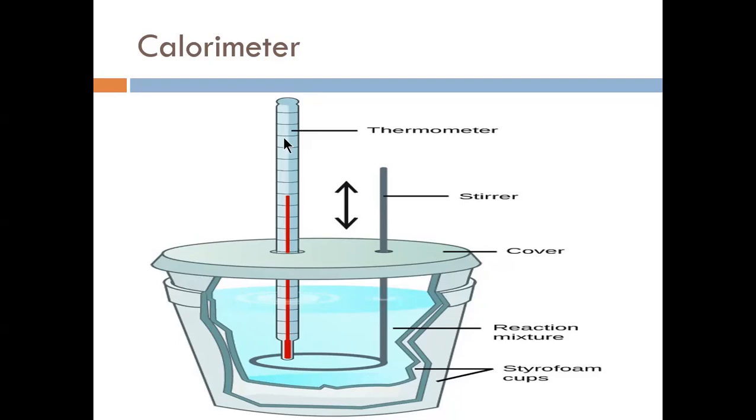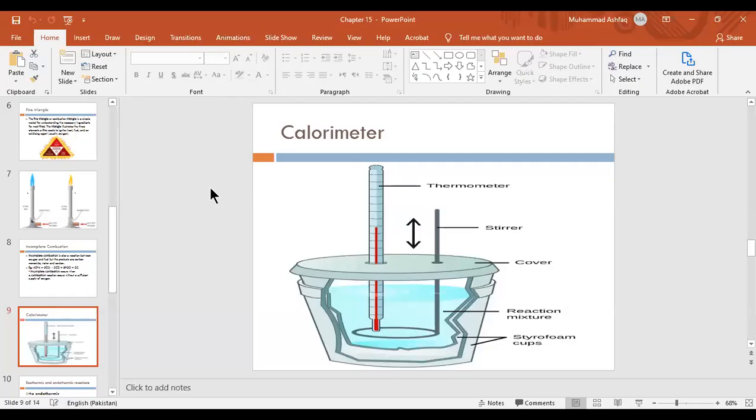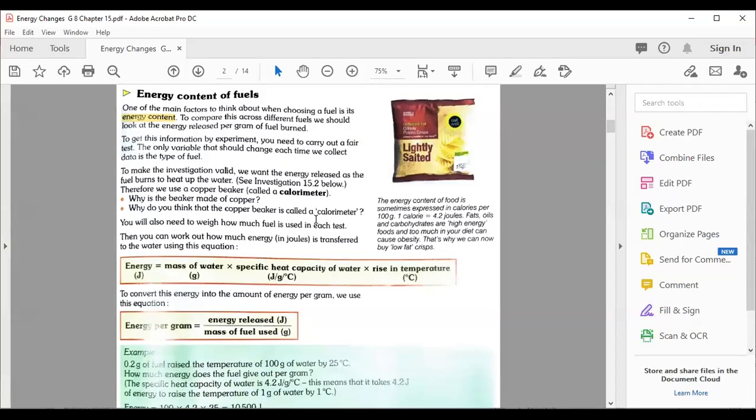Till here, my dear students, if you have any question, please raise your hand, otherwise type no. Yes, Ahmad Musab. Sir, we will put the burning fuel in the styrofoam cup? Yes, we will put this calorimeter on that fuel. Okay, yes, Hussein.